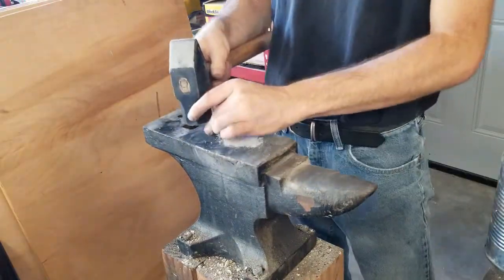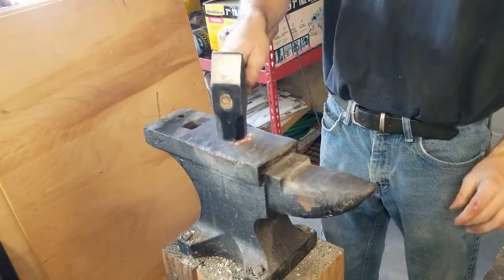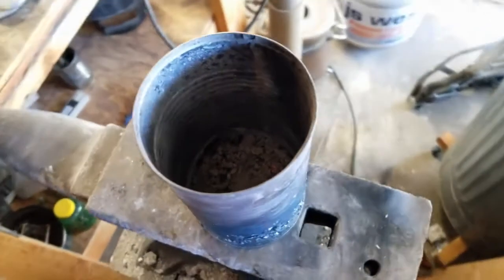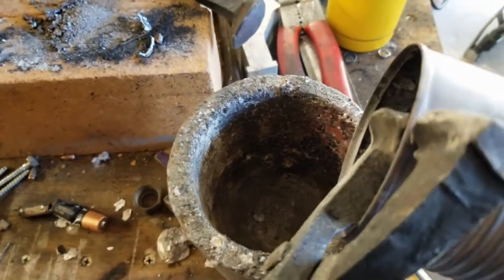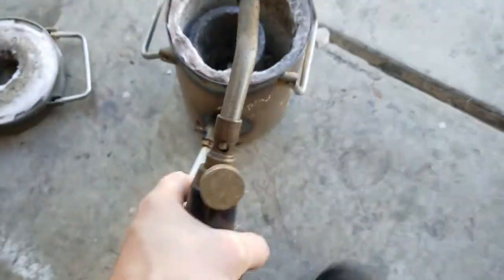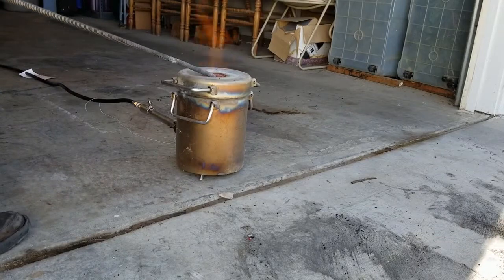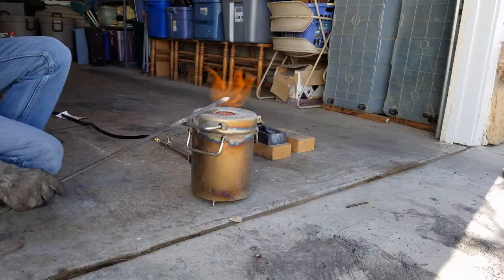First off, I'm going to start by crushing up these antacid tablets. These antacid tablets contain calcium carbonate as well as a bunch of fillers, so I'll also have to burn off some of that filler material and hopefully get something relatively pure. I also decided to throw in a couple of antacid tablets on top of the whole mixture, since they were probably just going to be destroyed by the fire anyway.